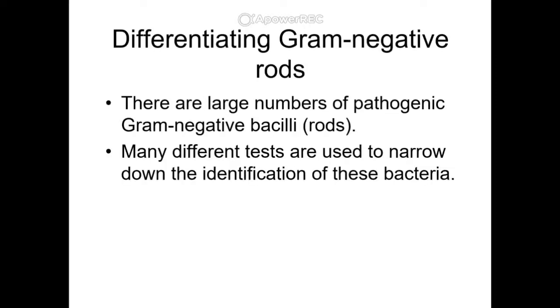In medical microbiology, gram-negative rods play a very important role. There are a large number of pathogenic bacterium that are gram-negative bacilli or rods, and we have many different tests that are used to narrow down the identification of these bacteria.